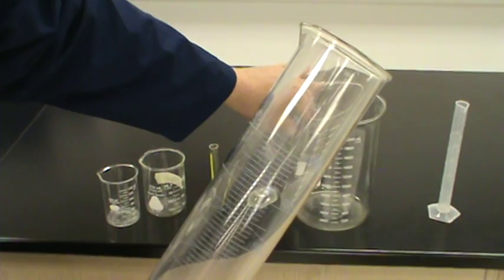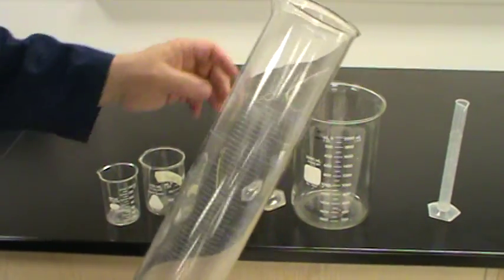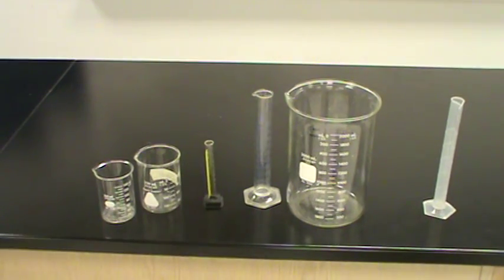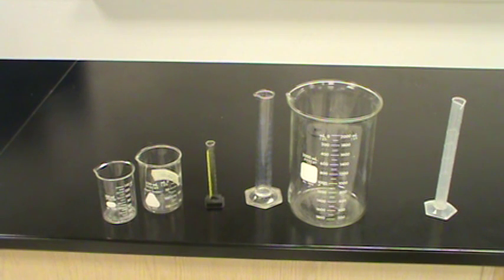Because this is 2000 milliliters, let me step over here to the sink for a moment. We're going to put in about half. We're going to fill this one up for you. If you can hear it, we're filling it up.